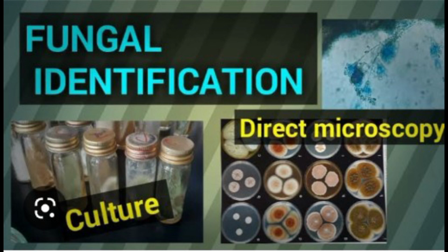Observe the fungi, which appear dark blue. Mycelium, the hyphae may be seen as septate or aseptate hyphae. Spores, sporangia, and other fungal structures may also be observed.